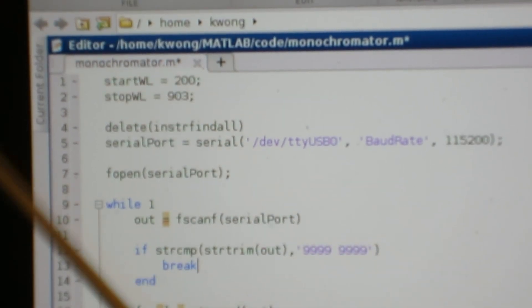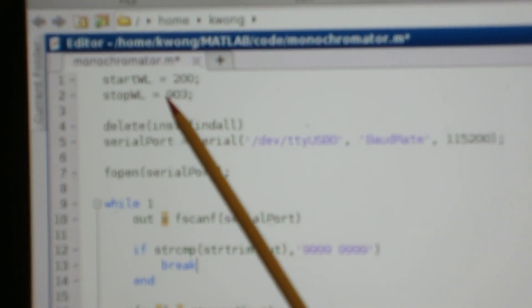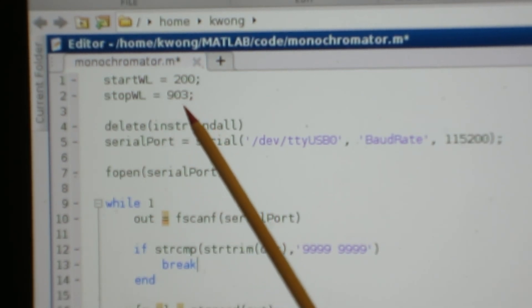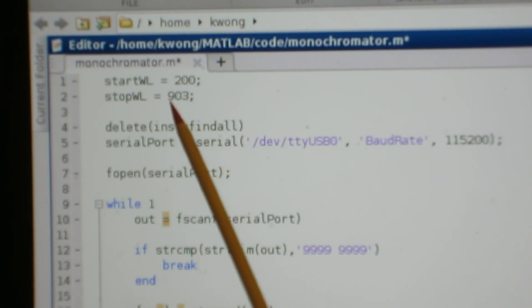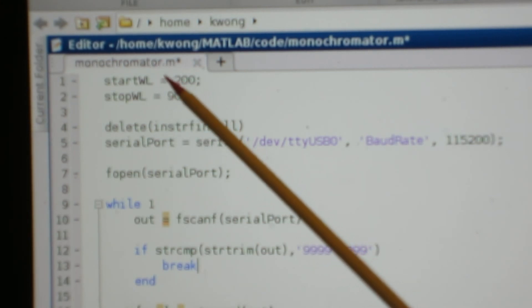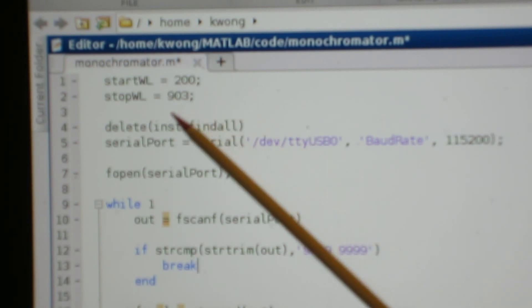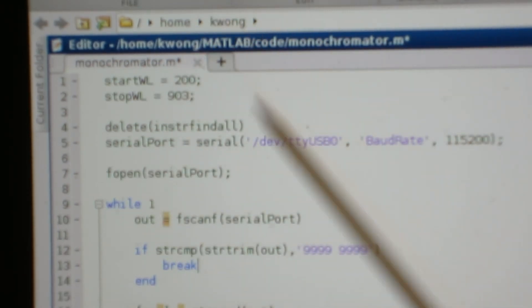So here you can see I declared two variables. The start_WL is my start wavelength — I wanted to start at 200 nanometers. The stop wavelength is 903, which is basically when I turn the dial all the way until the meter can't turn anymore. By defining these two values, I don't have to calculate the ratio of my optical encoder to the diameter of the micrometer. Once I know the start and stop, I simply count the pulses and average it out over that range, and then I have my spectrum.